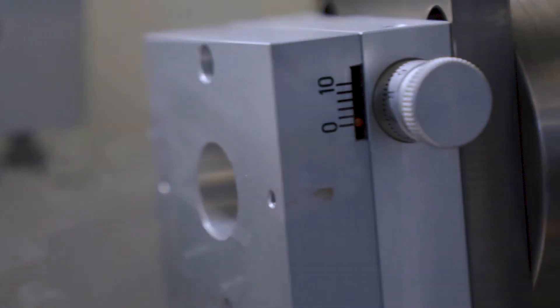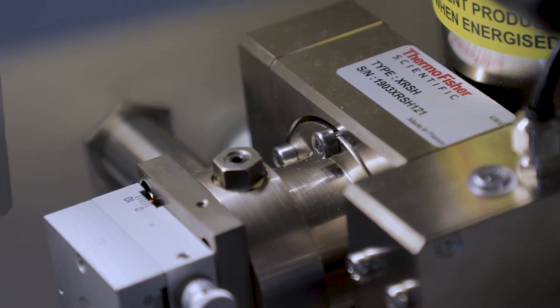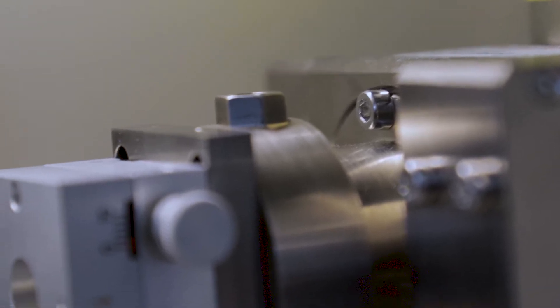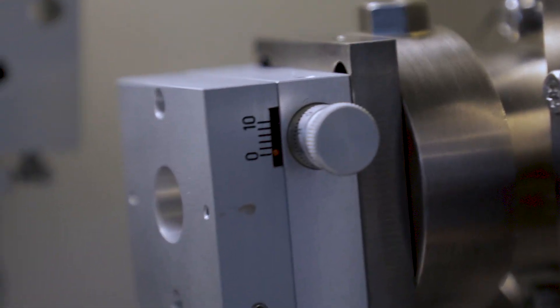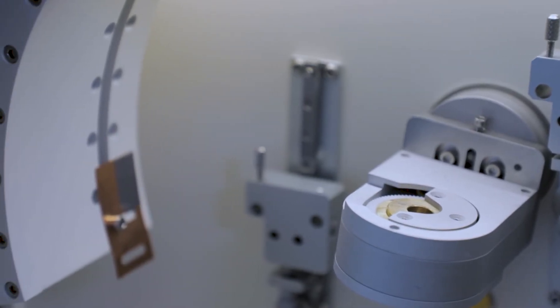Microfocus X-ray sources are low-power X-ray tubes that generate a very brilliant beam. This design gathers incident-scattered X-rays using a mirror system to collect and focus the beam. Even at low power, the X-ray flux at the sample is much higher than in traditional systems.